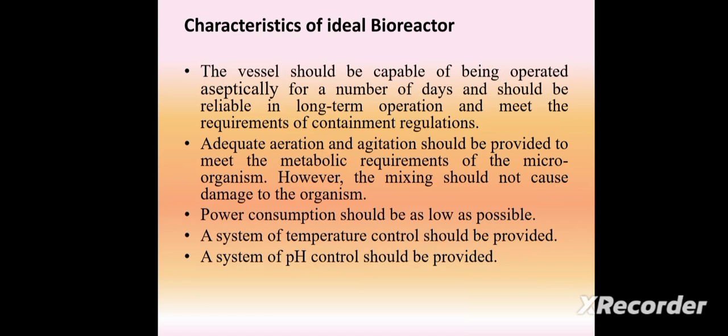Then the second important point, it must provide adequate aeration and agitation to meet the metabolic requirements of the microorganisms. Through these two processes, aeration provides an adequate supply of oxygen to the microorganism for aerobic fermentation, or whenever there is a requirement of oxygen.